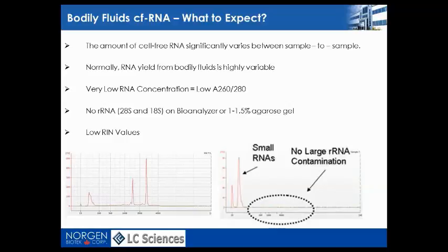The low abundance of microRNA in serum and in different other bodily fluids can hardly be determined using spectrophotometers, NanoDrop, or bioanalyzer. A robust and sensitive method for the analysis of body fluid microRNA is their relative quantification by stem-loop reverse transcription RT-PCR for one of the most abundant microRNAs, which is miR-21, for example, or you can use a small RNA housekeeping transcript like the 5S ribosomal RNA. This has been widely used for the sensitive detection of low abundance circulating microRNA with high reproducibility.